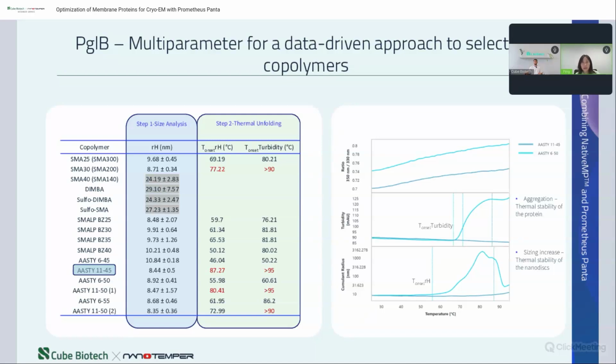For instance, we were aware that without the embedded protein, breaking down the nanodisk along the thermal ramp alone does not lead to this increase in turbidity, the formation of large amorphous aggregates. We think that the unfolding-triggered aggregation of the embedded protein's soluble domain is what made the turbidity go up.